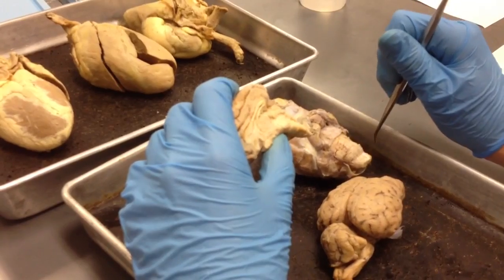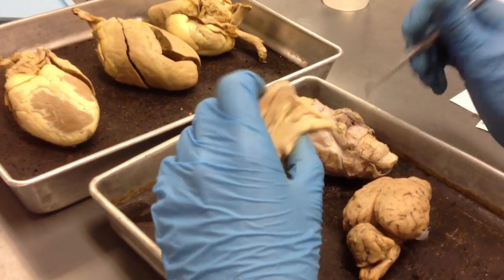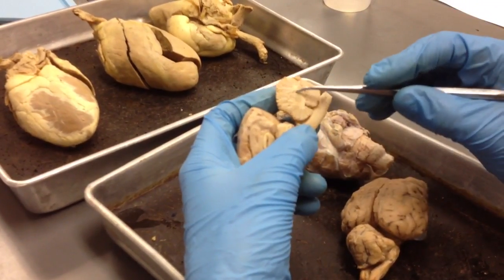And then the arbor vitae. So the arbor vitae is the tree of life inside of the cerebellum.